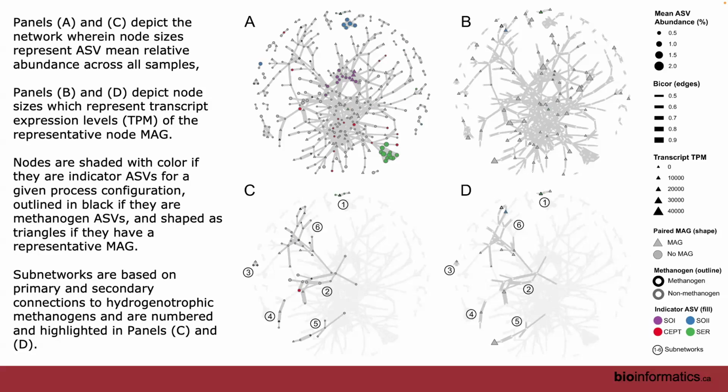Now, we still have a very large amount of data associated with this, including metagenome and metatranscriptome. We just haven't had time to work through it. But the next step for this would be to dig into those metagenomes and those metatranscriptomes and see if we can better support these different consortia that are based on these methanogen ASVs. So that was kind of the end of that story.